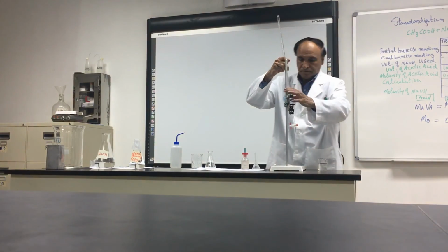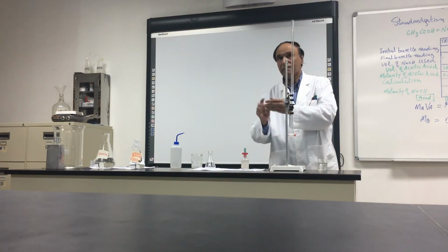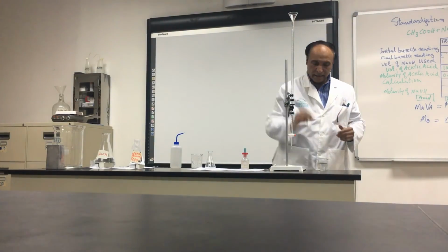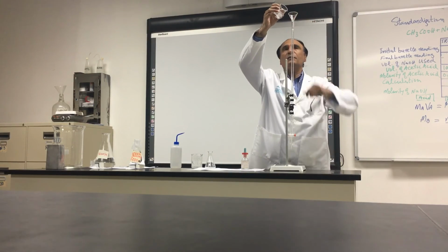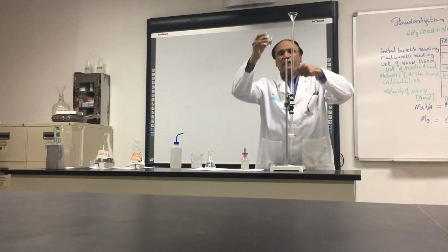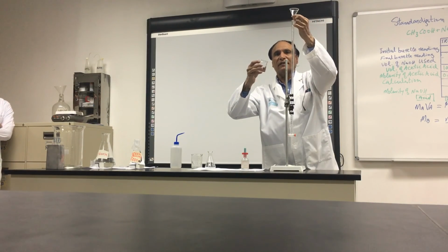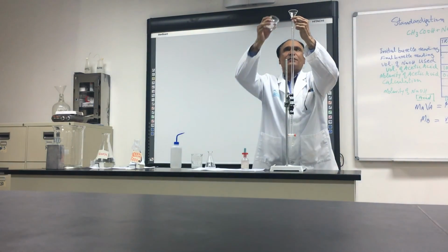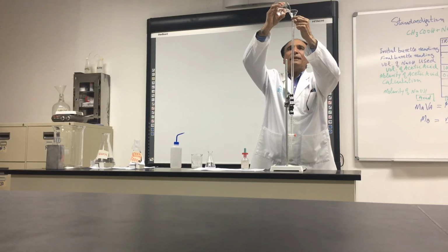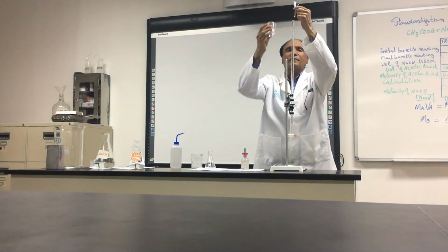So put it over here, close it, put the funnel and put sodium hydroxide over there. If you put it like that, look over here, there is air and it can bump out. So the best way is move it a little above, to give a space for the air. So fill it, bring it above 0. If it is below 0, it's okay, no problem. But bring it above the 0.